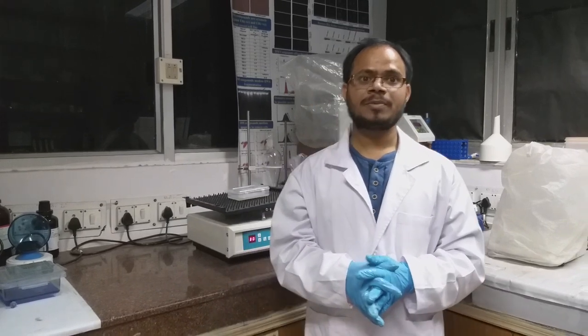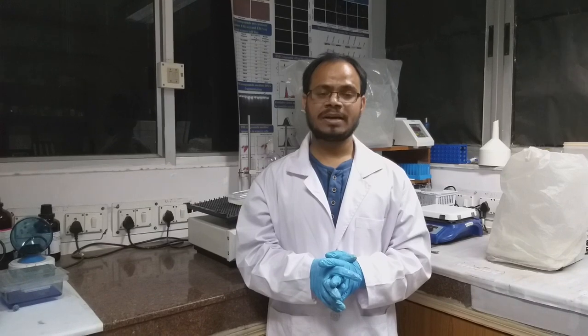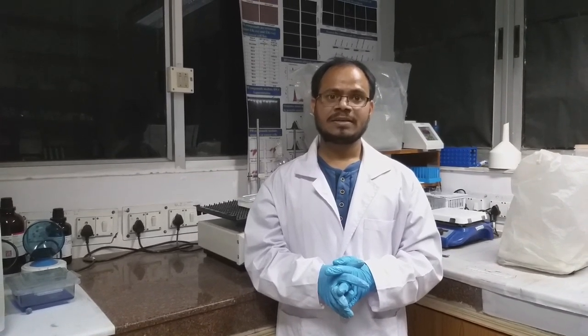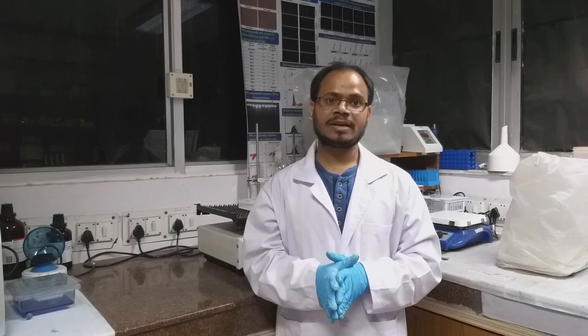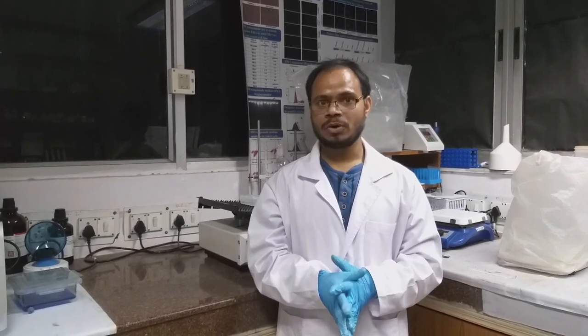After the blocking of the membrane, we have to remove the membrane and incubate with the primary antibody without washing. The main purpose of the blocking is that it will occupy non-specific sites other than the respective protein, so that when the antibody comes, it will bind to that specific protein and give no noise.